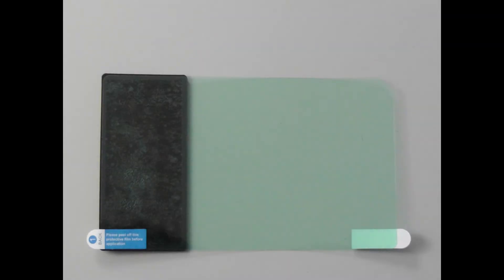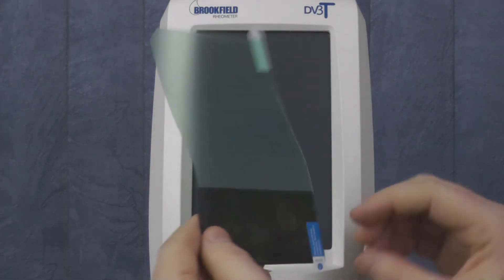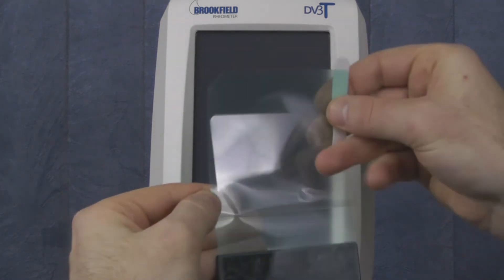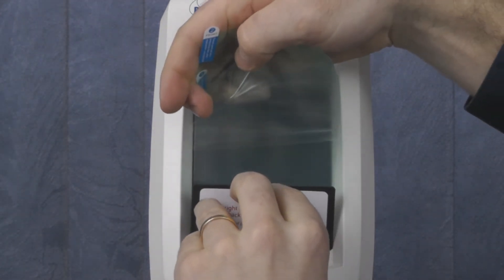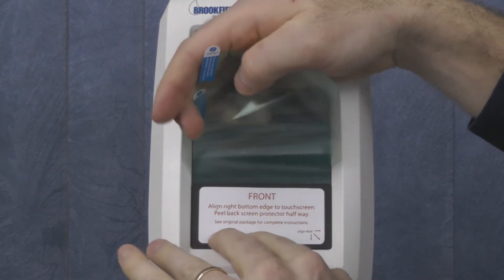Once the screen is clean, identify tab 1 and tab 2 prior to removing any protective layers. Remove the bottom half of tab 1. You then align the foam backing of the protector to the bottom right-hand corner of the screen. Alignment is critical — if the screen protector is not aligned properly, you may lose functionality of the touch screen.